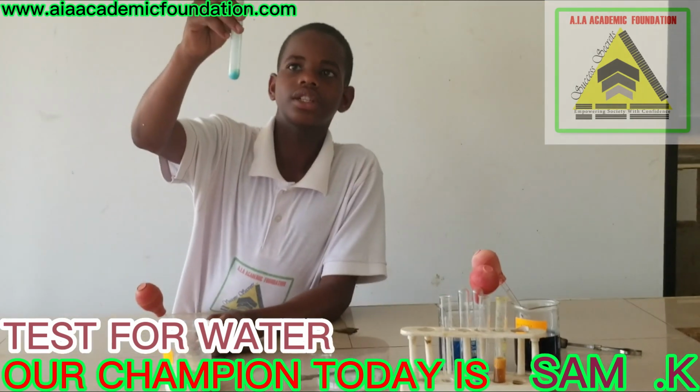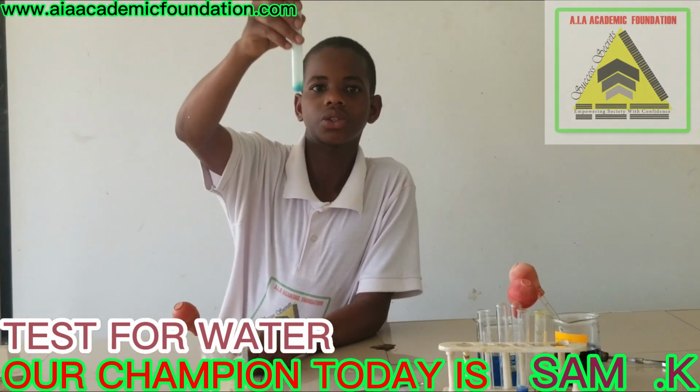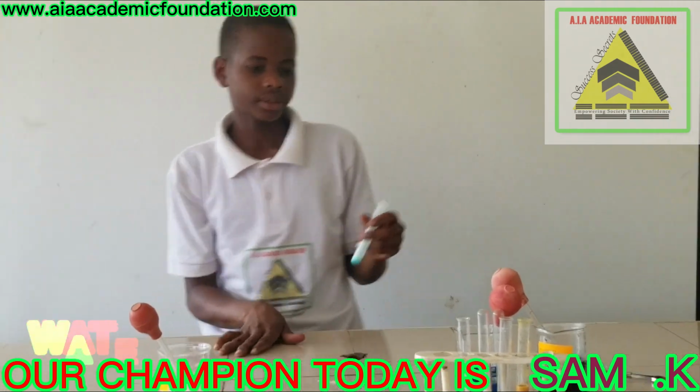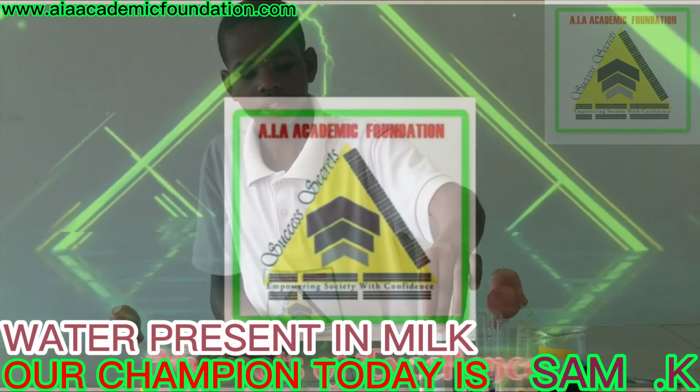As you can see, it has turned to a dark blue color. So we conclude that milk contains water, which is one of these liquids.